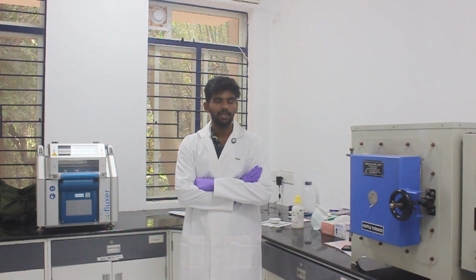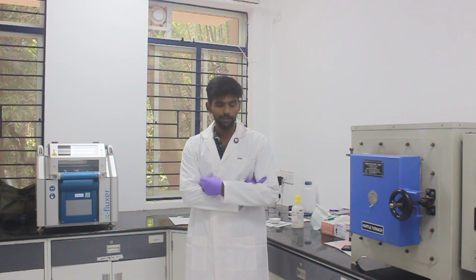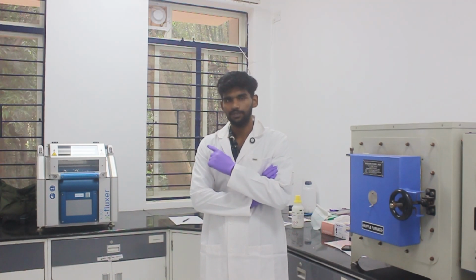Myself, Purushothaman. I work as a lab manager in the IISc department. Today, we will be making a video presentation of samples which have been prepared for XRF. In the preparation room, it's mandatory to wear an apron, lab gloves, and a lab sheet. The XRF is a Rigaku Primus IV. We are making a bead and a pellet for this video presentation.